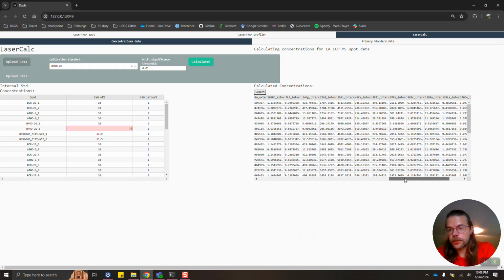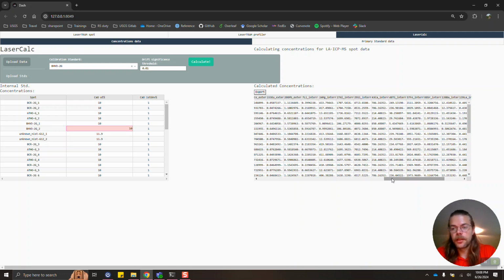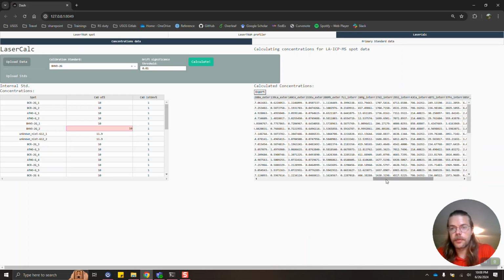So the difference between these two is that external error is including the uncertainty in our primary calibration standards, and by and large this is the uncertainty value you should use when you're comparing between data sets. If you're only comparing internal uncertainty, so data uncertainties within your own data set, you can go ahead and use this internal uncertainty. So that's not including uncertainty in the primary standard. That's the only difference between those two. The internal error is always going to be smaller than the external error, so it might be tempting to use that, but when you're comparing between other labs and other data sets, that's not the correct choice to use.